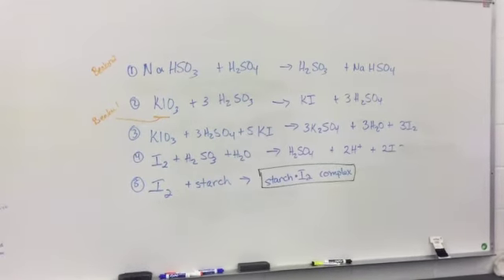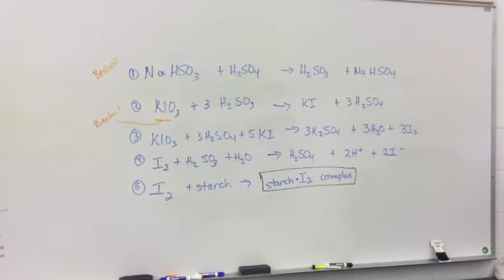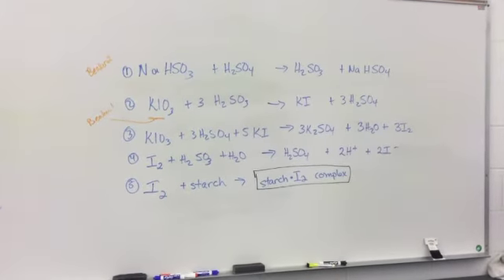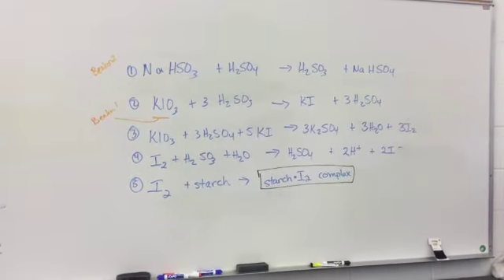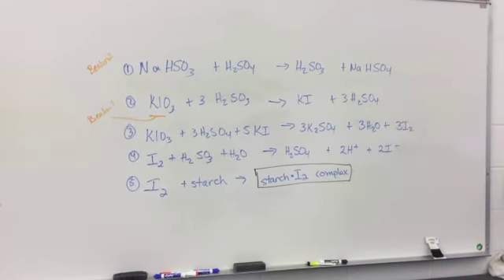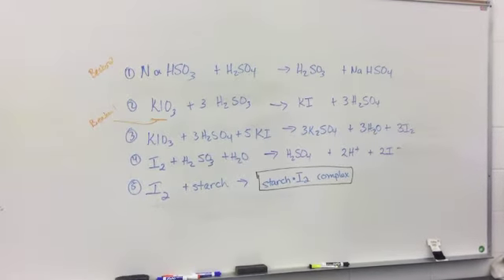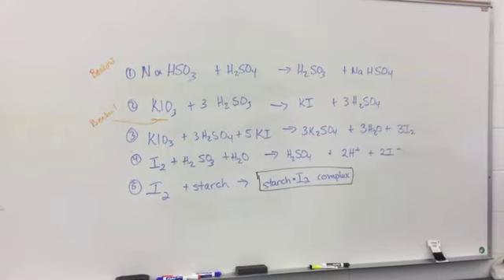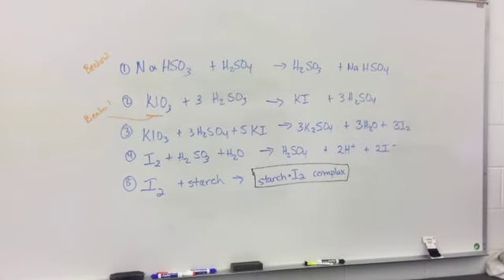Now iodine is usually kind of a brownish color. You might be able to find this in the pharmacy and you would put it on cuts as a disinfectant. This is what's going to form our final complex. When I mix it with starch, the complex is a dark blue-black color.